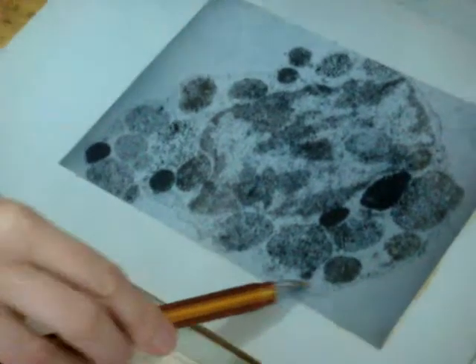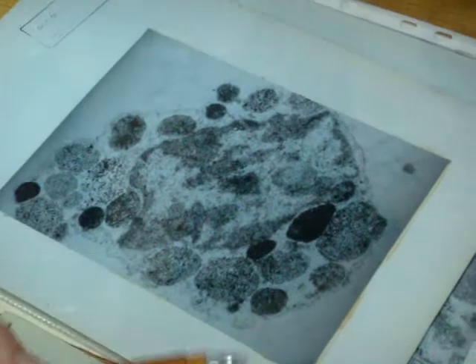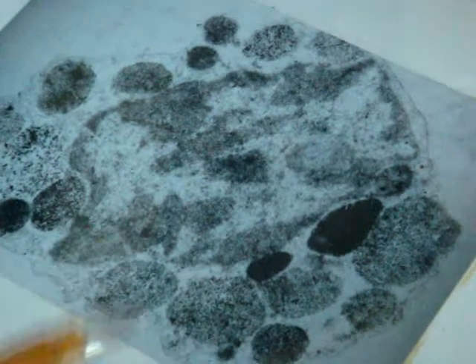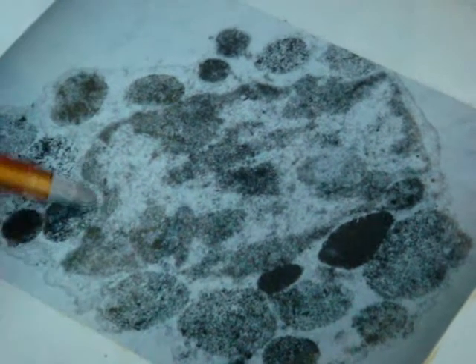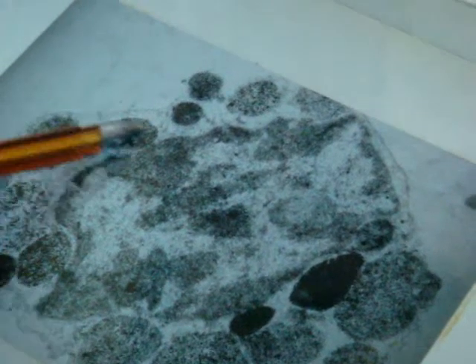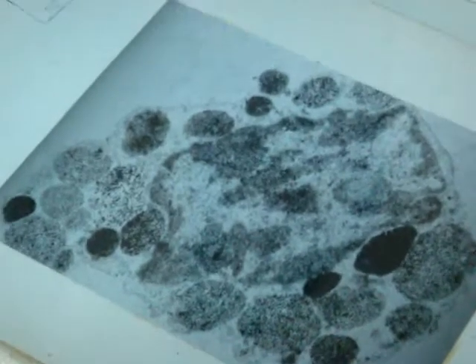What is this? Look, we can see one cell, with a very clear cell membrane. Does this cell have a basement membrane or not? No. So this cell belongs to connective tissue. Now let's look at the organelles. We can see the nucleus and large granules inside. Yes, it's a mast cell. Do you remember what substances a mast cell produces? Okay.